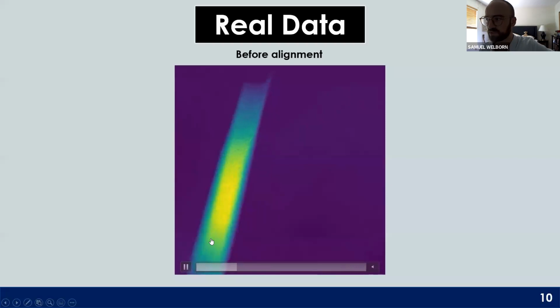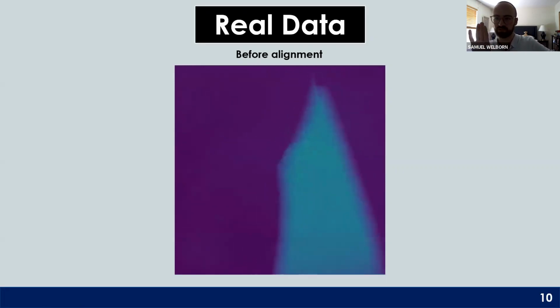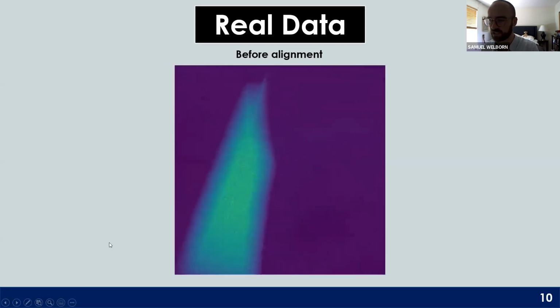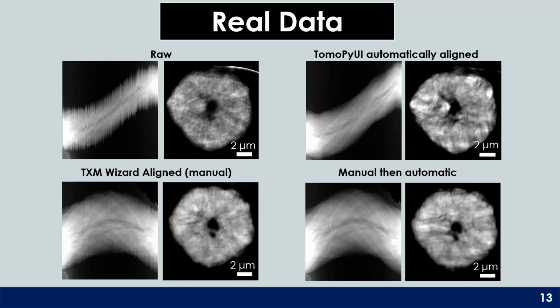And then you would end up with something that doesn't necessarily rotate around the center of rotation, but rotates directly on the center pixel. You're setting the center pixel to be the center of rotation. So that changes the shape of the sinogram. It's still just a translational thing. There's no affine stuff going on. You can see that the center here has been shifted so that it's rotating just around that center pixel. I don't know if that was clear, but does it answer how those two different things work? Yeah, great. Thank you so much for answering.